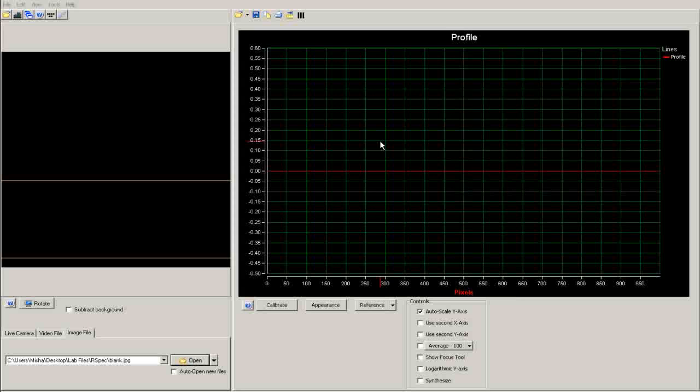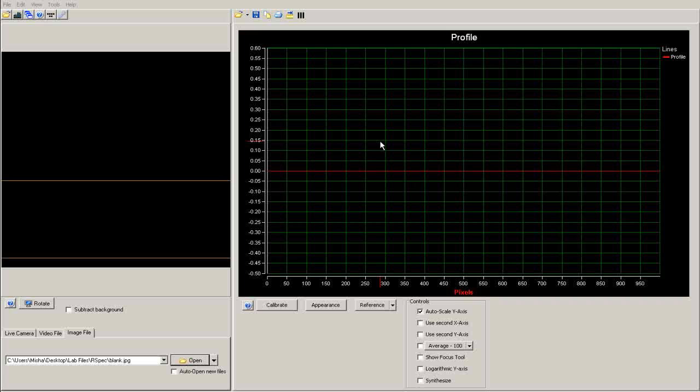To import an image into RSpec, first open RSpec. Notice that there are two windows.